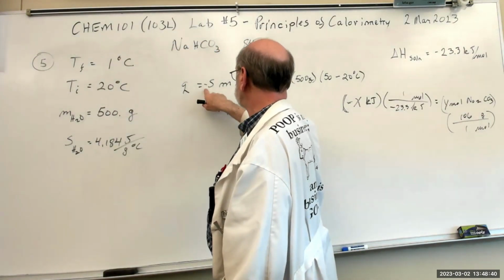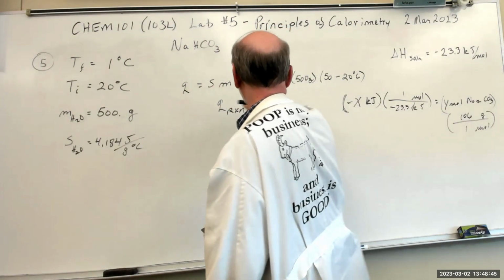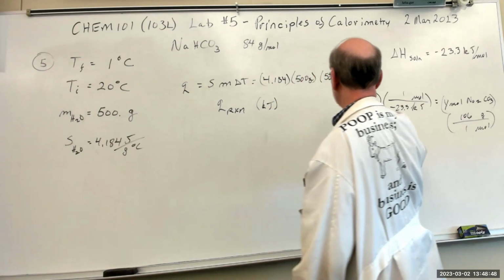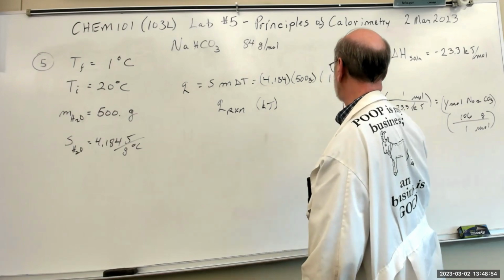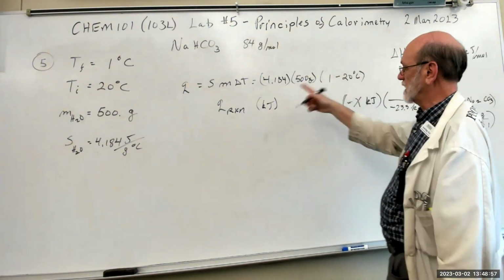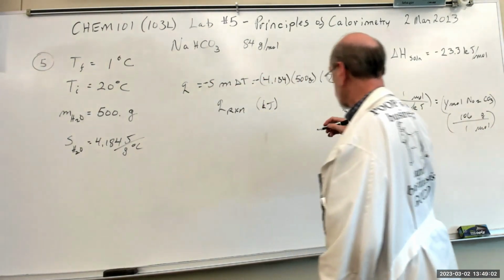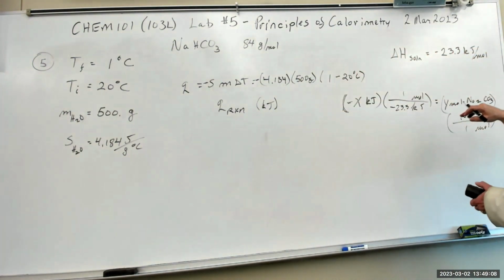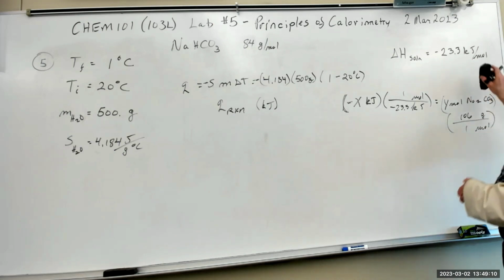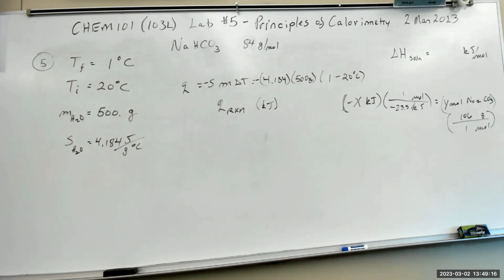And I don't think we need a negative here, because we know this is going to be 1. Well, that'll give us a negative value. Yeah, we do need a negative. Sorry. Because we need a positive value. And that'll give you the kilojoules for that reaction. And then you need a different value here, because this solution is, I think, 17.15.